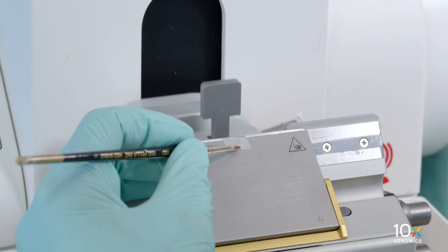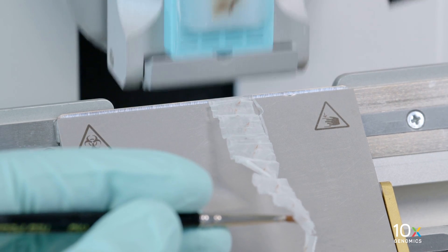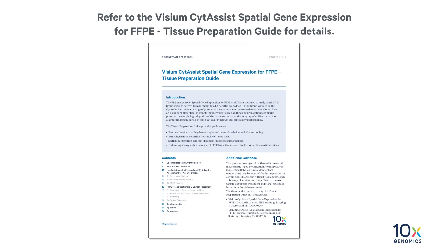To collect sections, place the paintbrush tip slightly above and parallel to the blade. Lift the section by lightly touching the edge with the paintbrush while rotating the wheel handle. Place sections inside a pre-cooled microcentrifuge tube for RNA quality assessment. Refer to the Visium CytAssist Spatial Gene Expression for FFPE Tissue Preparation Guide for details.